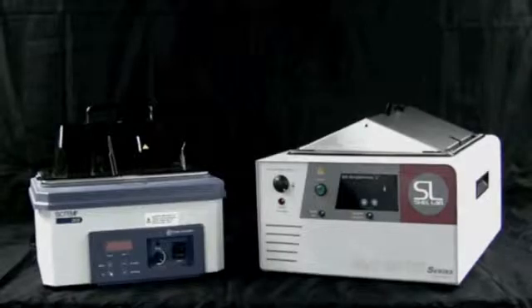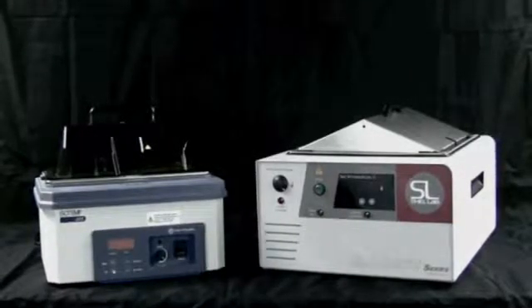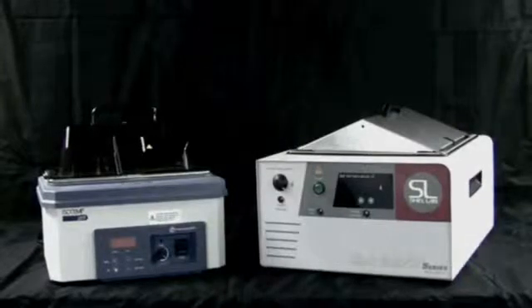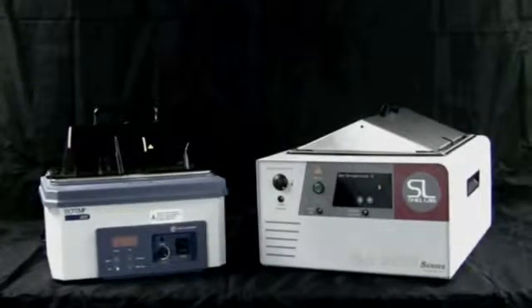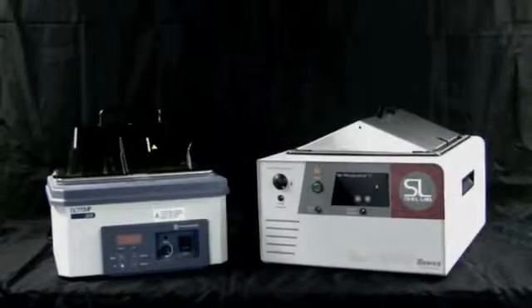Lab Armor beads can be used in most general purpose water baths and dry baths with exposed or recessed heating elements that are centrally located. You should avoid using beads in shaking baths, circulating baths, and some European-made baths with float switches.